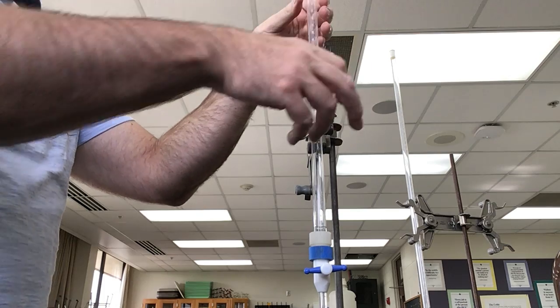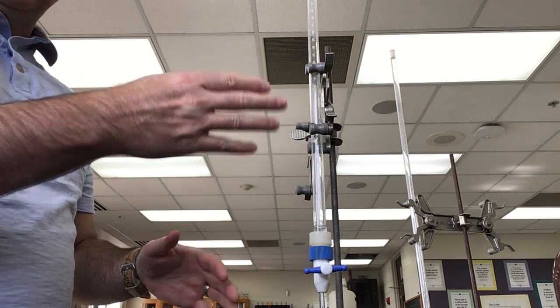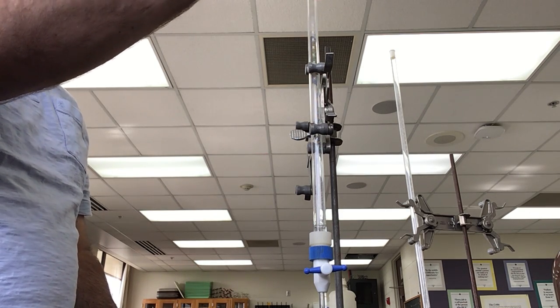This is a really good way of preparing your Buret for your titration. Once I've done this and I'm ready, I would fill up my Buret with my titrant, and I'd be ready to go.